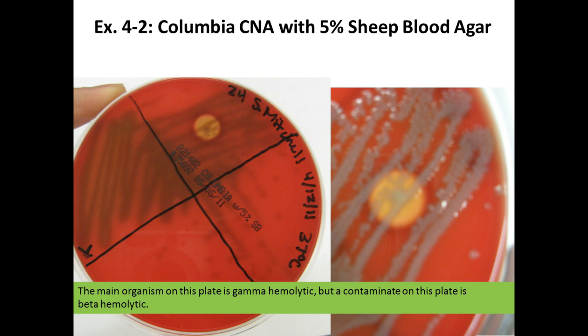So this was an interesting plate we got one semester. This is a good streak plate. Notice they did it right? The only problem is they probably breathed on this plate, because what do you see right here? That's a contaminant, right? That's not their organism. Most of this growth, this other growth, is their organism. Look at one little colony right there.